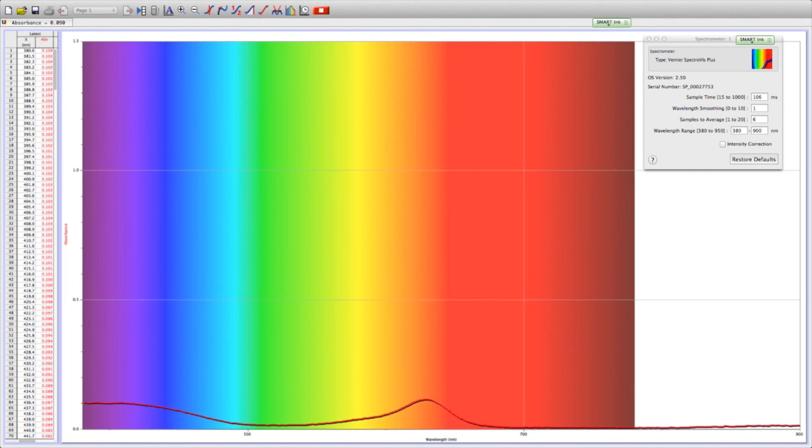The spec will show you the absorbance of your sample at a variety of wavelengths in the table on the left. Once the data has been collected, hit the stop button.